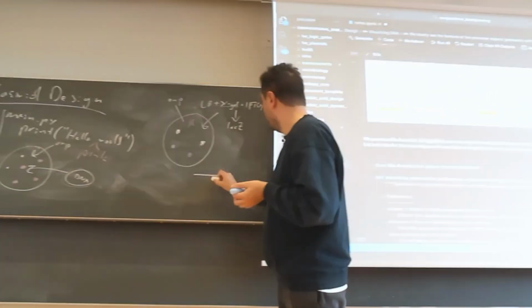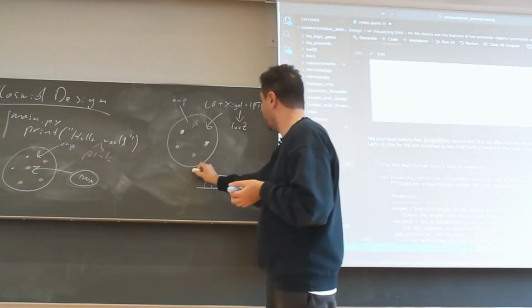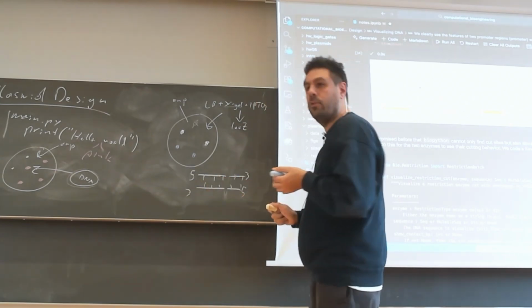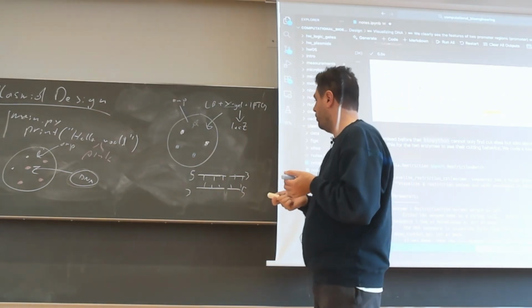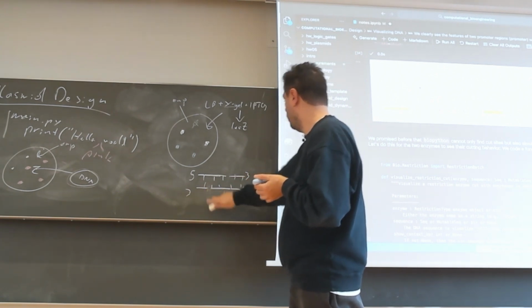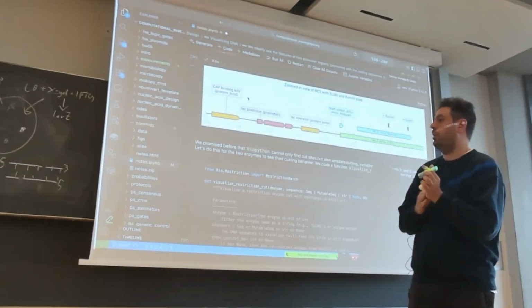Blunt meaning here we have the DNA, 5' to 3', 5' to 3', and the cut goes straight through. These blunt cuts exist, but they are typically a bit more difficult to treat. Cuts are often in a way that leaves some overhang, and we have to take that overhang into account.